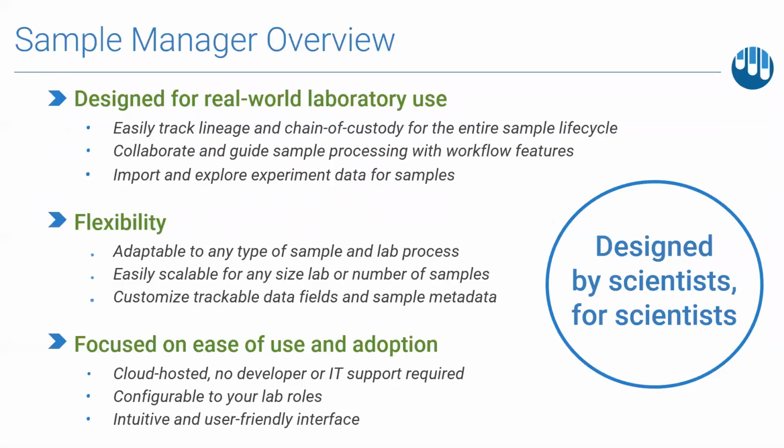Okay, just before we get into some of the detail around LabKey Sample Manager, I wanted to take a second to provide an overview of what Sample Manager is and some of the key benefits and values. Firstly, in designing and developing the product, we undertook many hours of consultations with different laboratories, scientists, and laboratory managers, and we embraced the insight to create different user personas to deliver a robust resource that represents what we think is real world laboratory needs and workflow. And I'll talk a little bit more about that shortly.